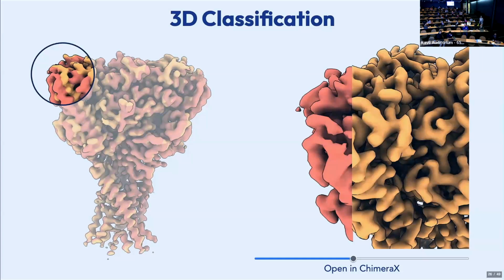Right. Okay. And the second question that has come up today, and probably also yesterday, is your absolutely great use of Chimera in all of these things. How did you do that? What did you do? And to generalize the usefulness of Chimera for everyone in the cryo-EM community, you could shout it out to them.